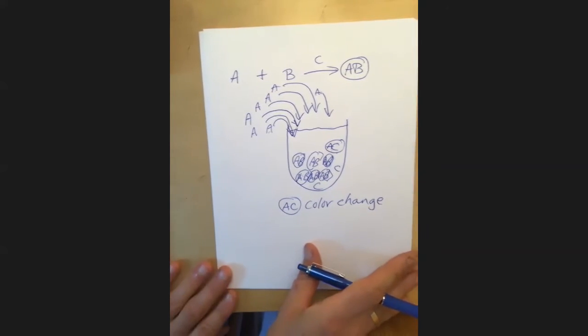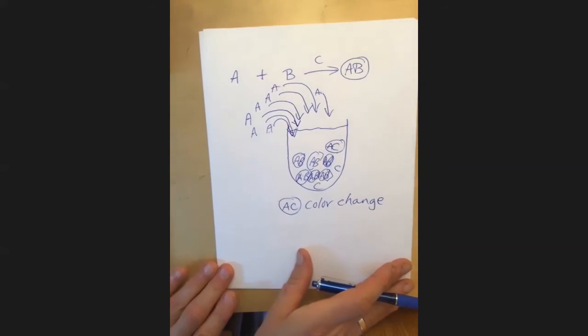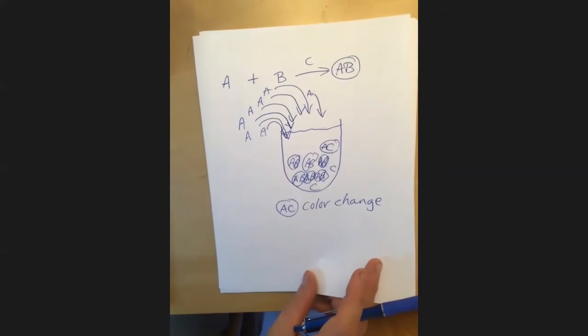So what we're now, this was with a generic A, B, and C. Those aren't real compounds, of course. So here is one that we're going to use and our students are going to use a lot. The compound is called phenolphthalein.